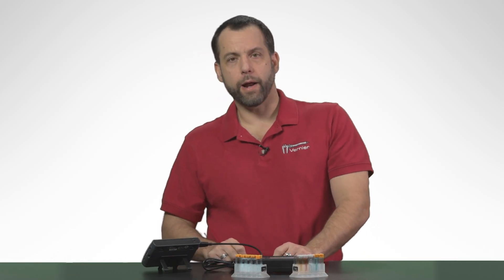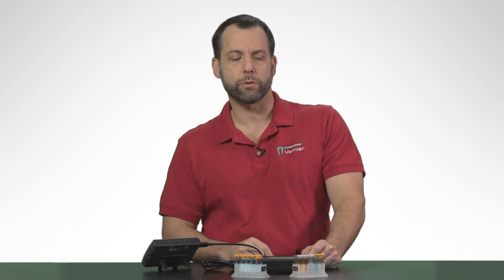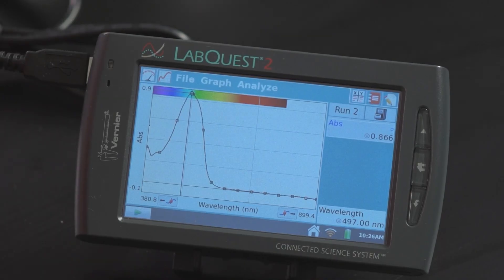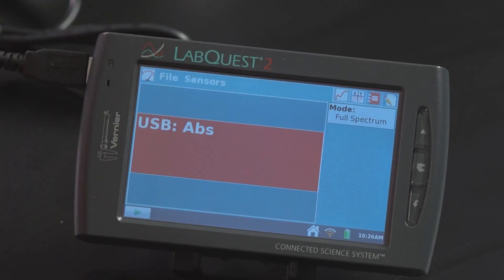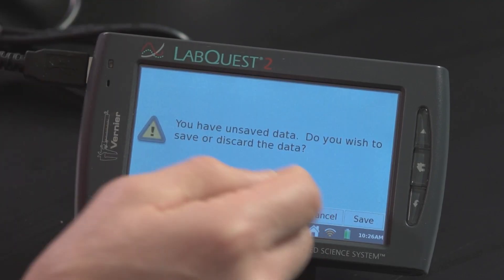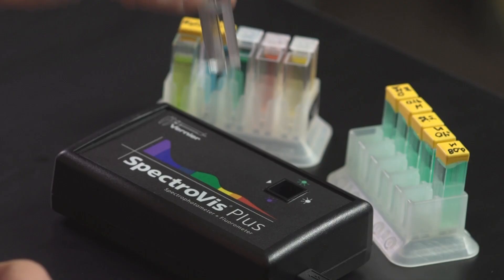Let me show you one other activity, and this is the reason why this spectrometer is one of my favorite tools to use — there's an activity that most biologists do called looking at the action spectra of chlorophyll. This lab is done at colleges and high schools, and instead of taking 45 minutes, you'll see that this takes about two minutes. I'm going to go back to the meter screen, select file, new, and discard this data. The chlorophyll extraction I've done uses some spinach and I've extracted the chlorophyll using isopropyl alcohol. So this is my blank — isopropyl alcohol — and I'm going to put that in the spectrometer and recalibrate again.